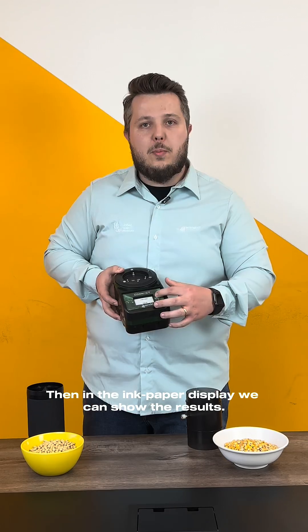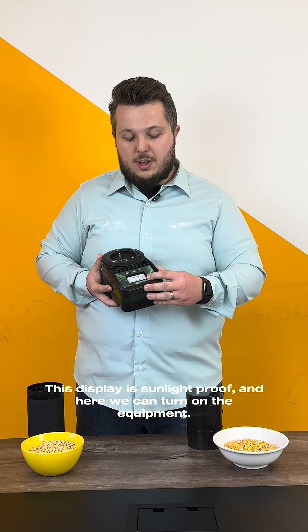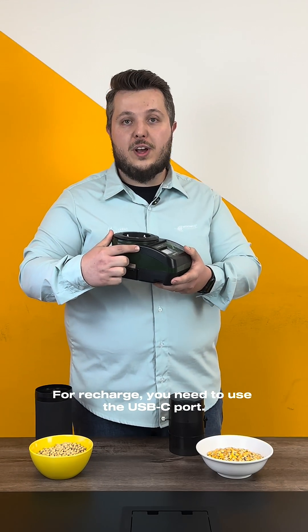Then, in the e-paper display, we can show the results. This display is sunlight proof, and here we can turn on the equipment. For recharge, you need to use the USB-C port.